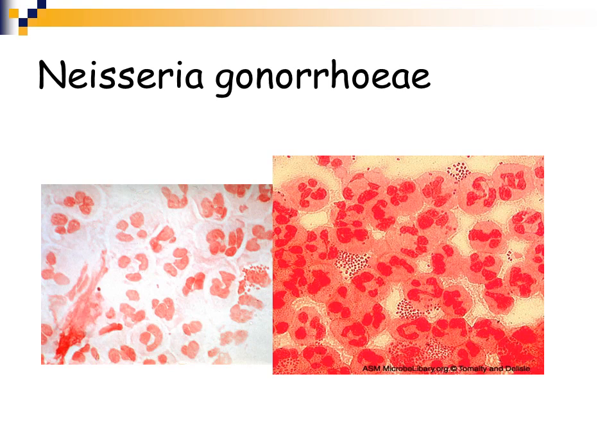So here is Neisseria gonorrhea, the white blood cells that you will see in the intracellular and extracellular gram-negative kidney bean shaped diplococci. So we are going to move on to the fourth part of the gram-negative cocci lecture.